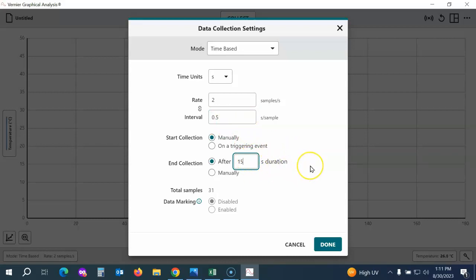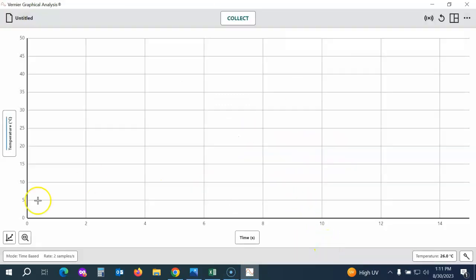You can set how long you'd like to collect data. I'm going to collect for just a short time for the purpose of this video. Refer to the lab document for the data collection settings. Then hit Done. You can see the x-axis has been scaled to match those data collection settings of only 15 seconds.